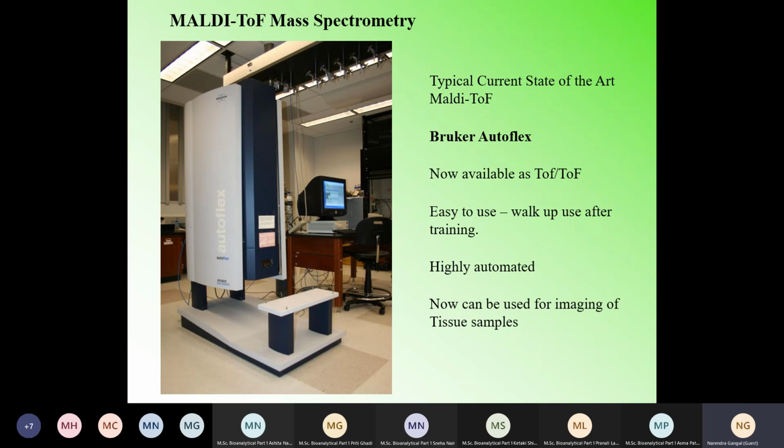I am not able to take out a sample; I have to do non-destructive testing only. So I may use the infrared microscopy, and if it is an organic compound, I am recording the infrared spectrum of the organic pigment spot by spot. That is how it is called imaging.